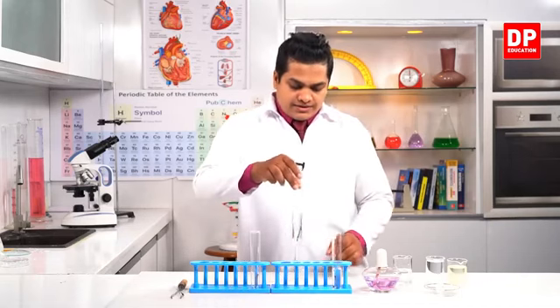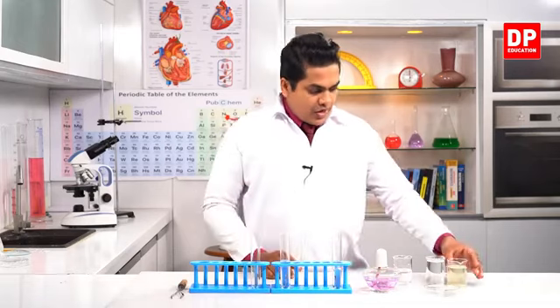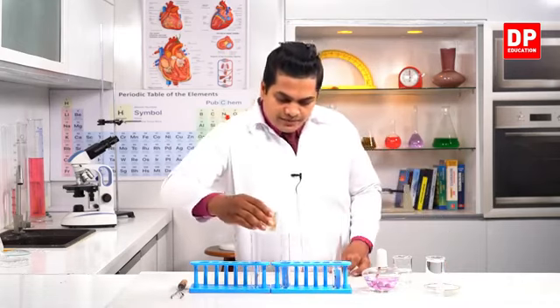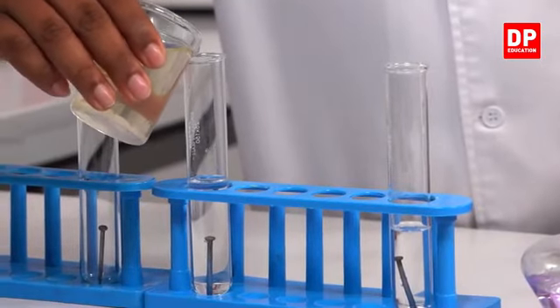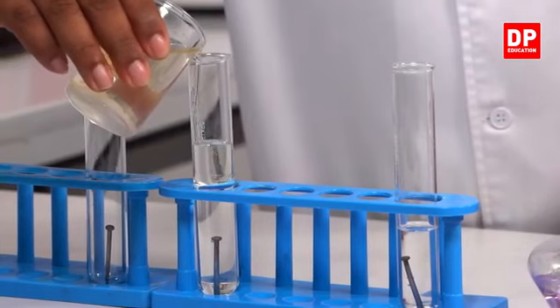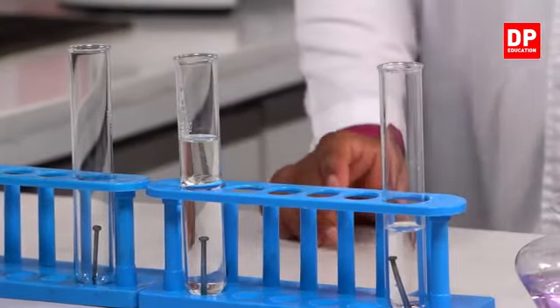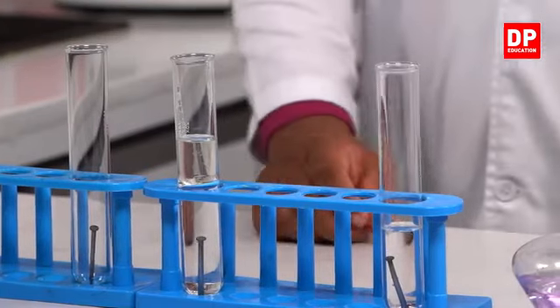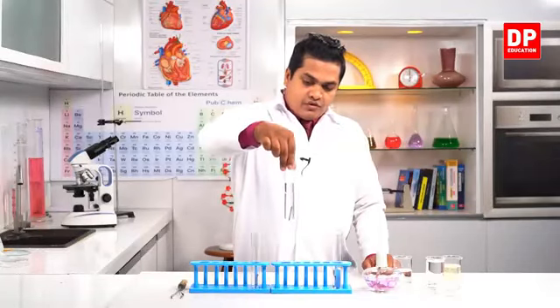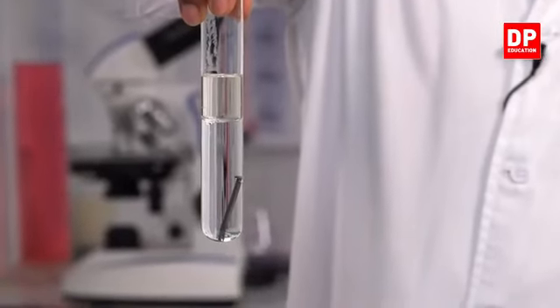I'll place the test tube like this and insert some coconut oil into this solution. Here you can observe that after inserting coconut oil up to a certain limit, the coconut oil layer and the water layer are getting separated like this, right?